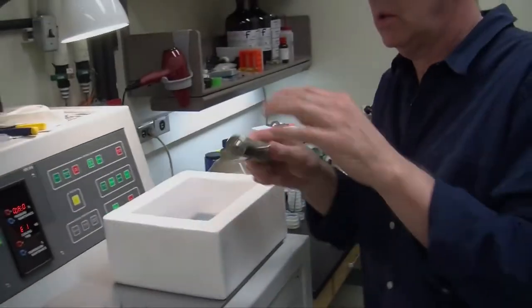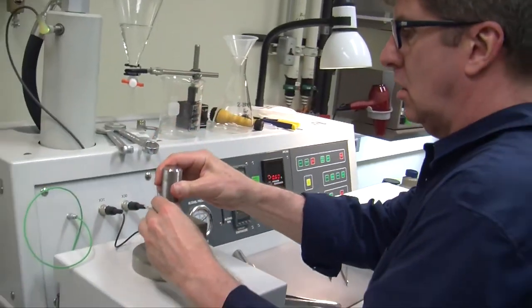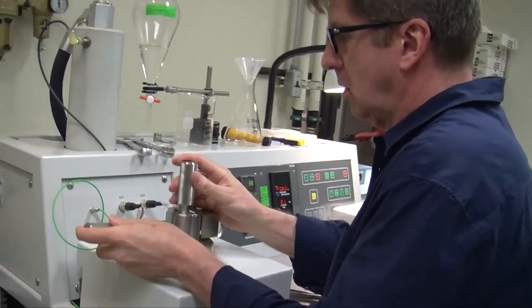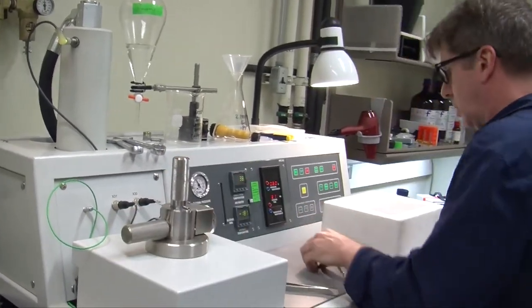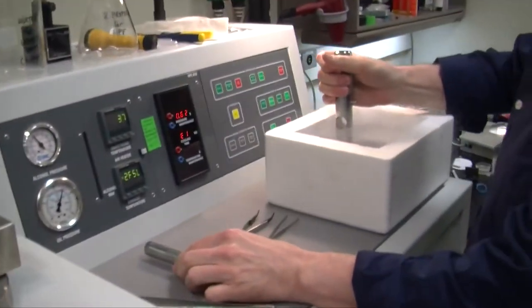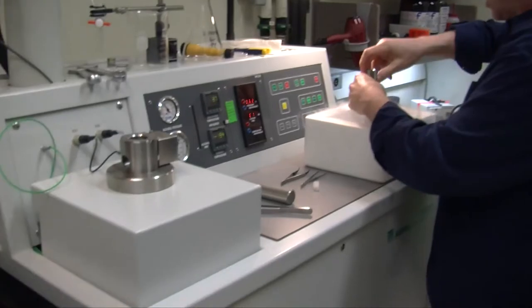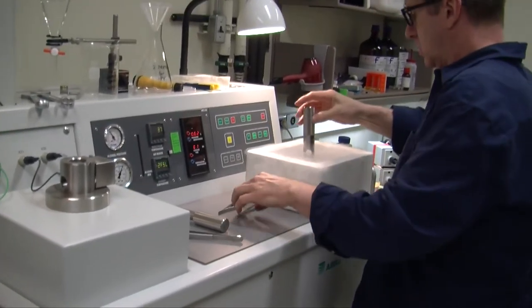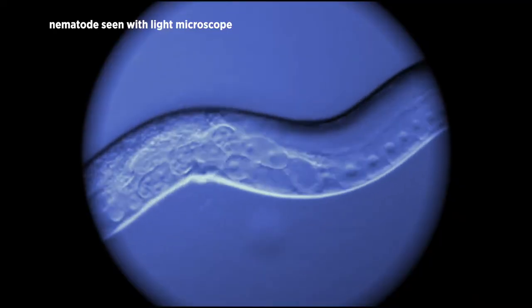So one piece of the equipment in the microscopy suite that we've been using a lot lately is the high-pressure freezing machine. Presently what we're using it for is to take nematodes and freeze them so quickly that they are frozen in vitreous ice.